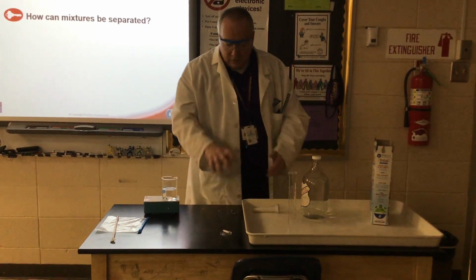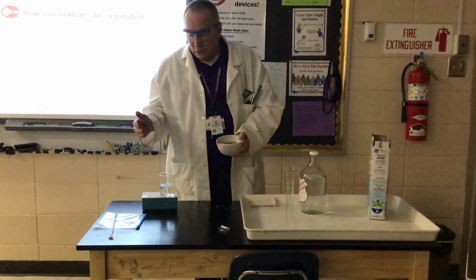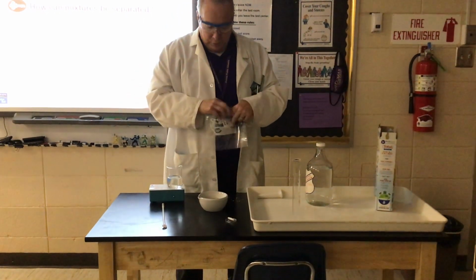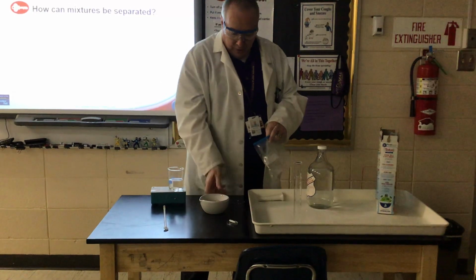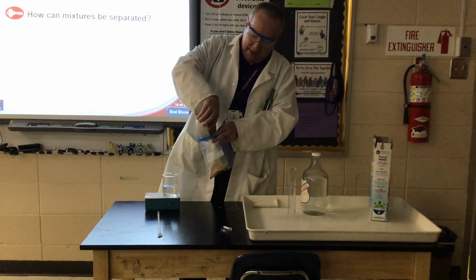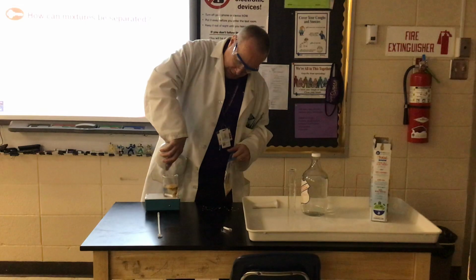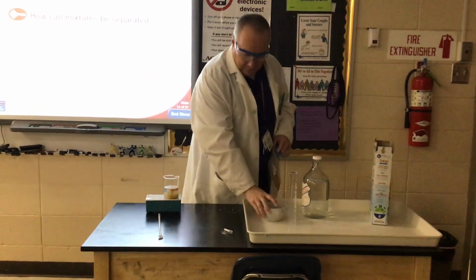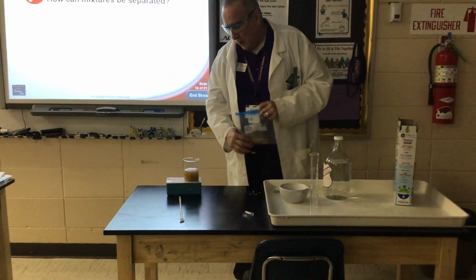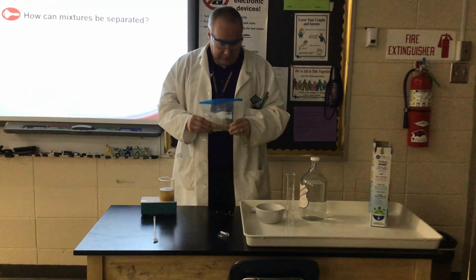So I'm going to take my finely ground cereal and split it into two parts. Half of it I'm going to put into a Ziploc baggie, and half of you will be conducting the experiment one way and half of you can conduct it the other way. And the other half I'm going to put into the water here, and I'm going to turn my stir bar on and let that stir for 20 minutes.